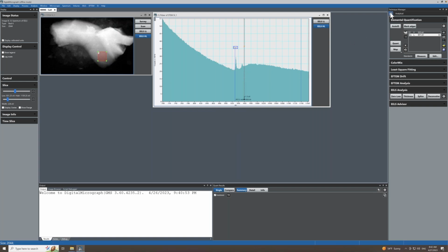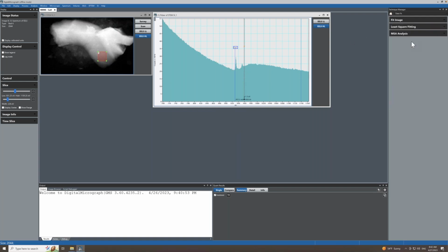Yeah. So that's in DataFit. There's an MSA analysis tool, which you've got some buttons here. That's actually, as Ray said, in another webinar that I didn't list on my slide, but you can find it on the YouTube channel.